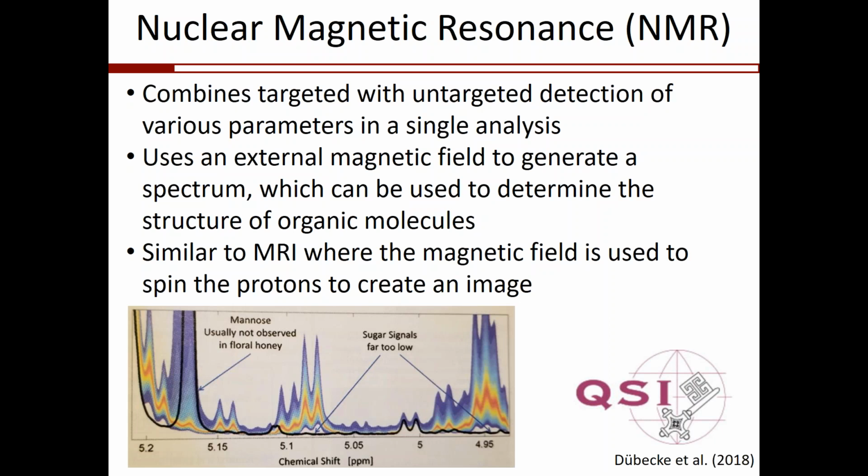And we are collaborating with QSI, Quality Service International. Arnie is going to be doing most of this analysis here, but here's an example of one of the spectrums. The dark line is the sample that they are analyzing, and the other lines are going to be their database spectrum.